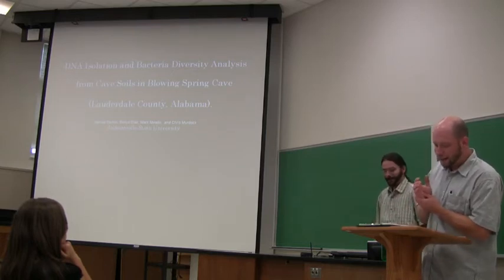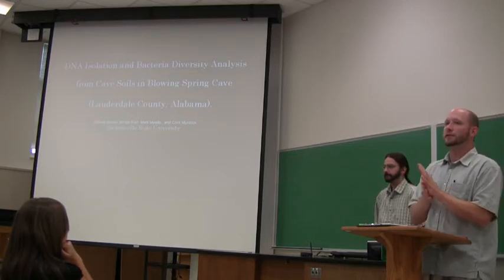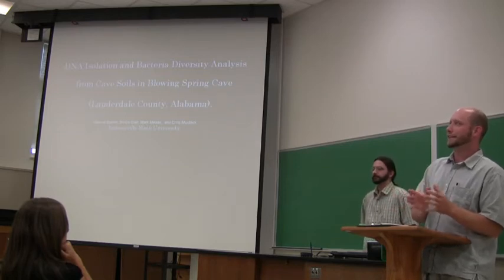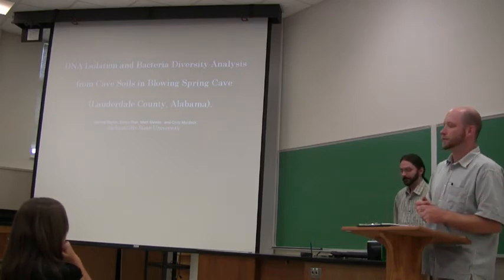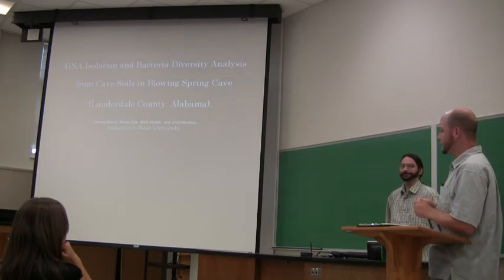The other thing is Sam was interested in studying microbes from soil samples, and there's nothing really dirtier, in terms of trying to isolate enzymatic quality DNA, than soil samples. Sam will attest to that, and he will mention it was rather difficult. He has one slide that describes it, and we spent months working on techniques.